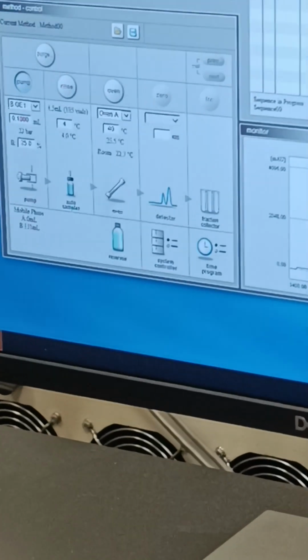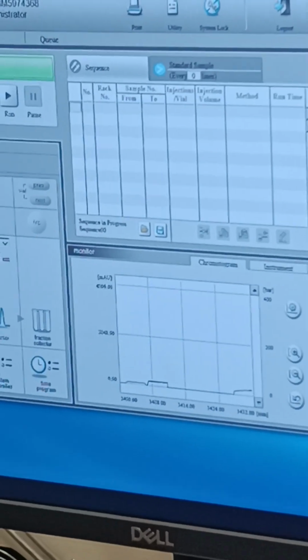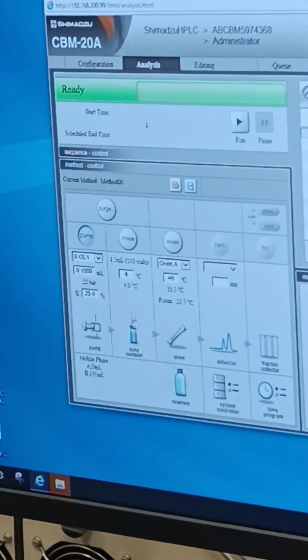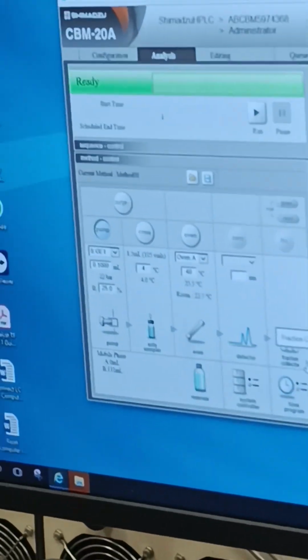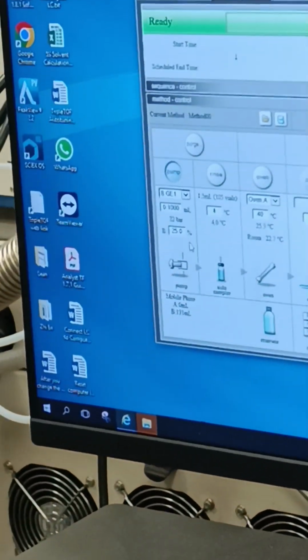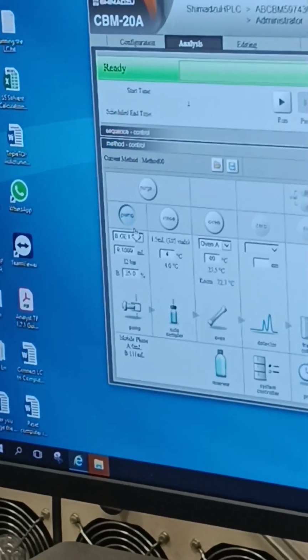Okay, so now it's about 22. It seems quite stable, starting from here onwards, right? So now I just change it to 25. Here I won't expect much change. It will still be somewhere around 22, 23. But I will just keep it for at least 1 minute. After you change to 25, you click pump again? No need. Once you change the number here, you just click somewhere else. Oh, if you click pump again, it will turn off. Yeah. Okay.